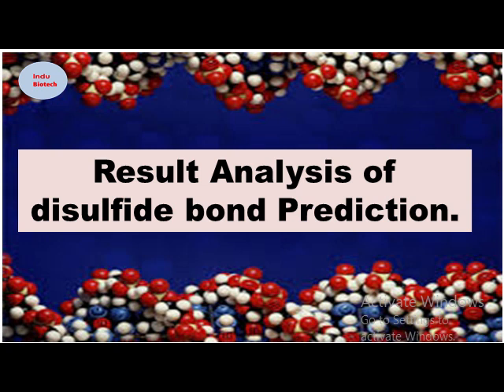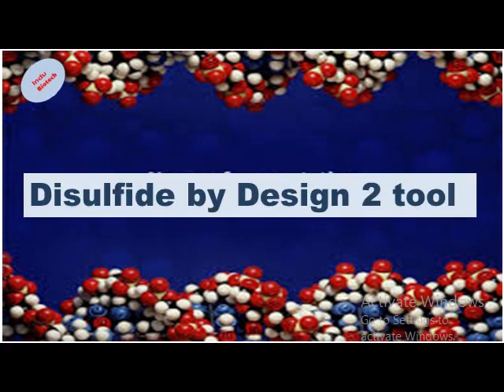As I discussed in the earlier video about the Disulfide by Design 2 tool, why we use this tool and how we access it. Today we will learn how to read the results of the Disulfide by Design 2 tool, which will become clear by watching this video properly. Let us start the main topic.